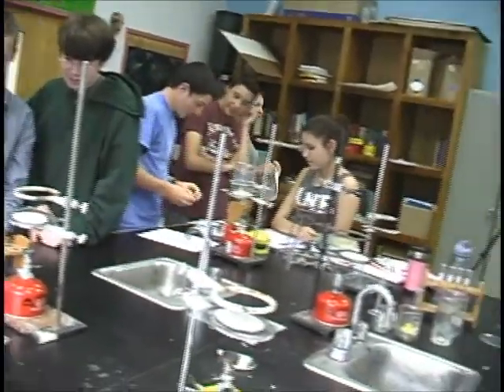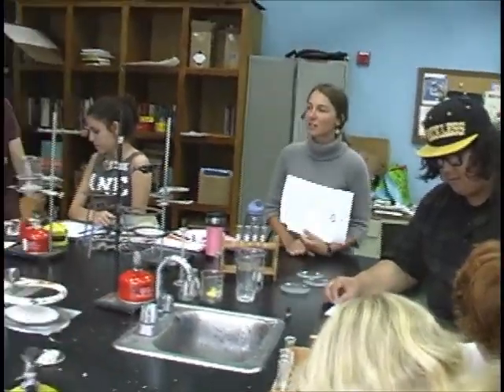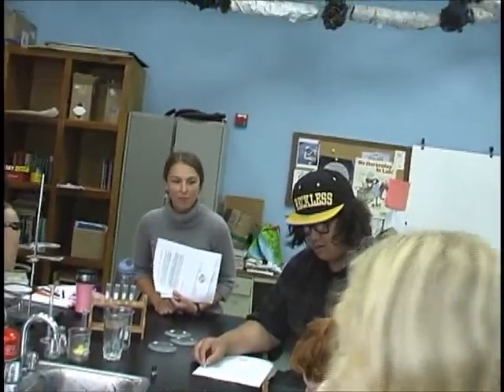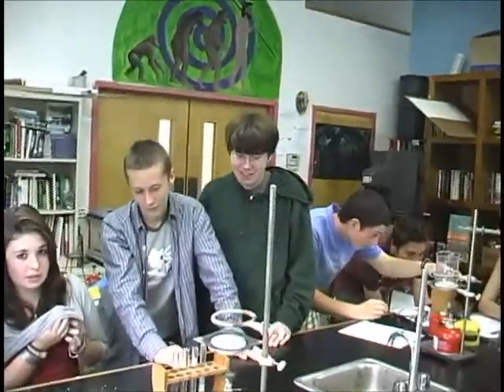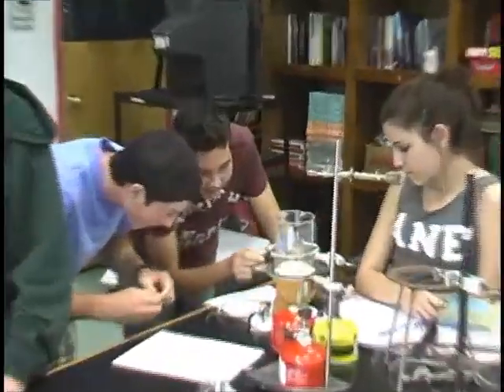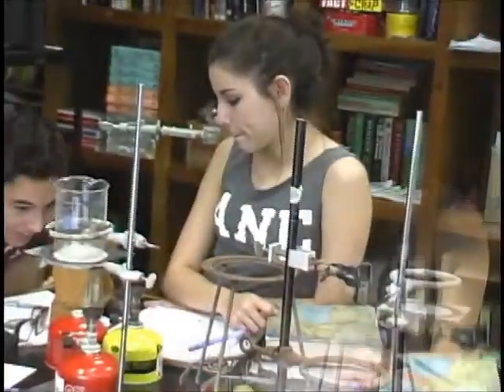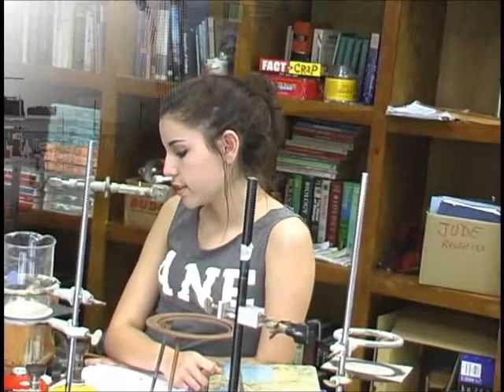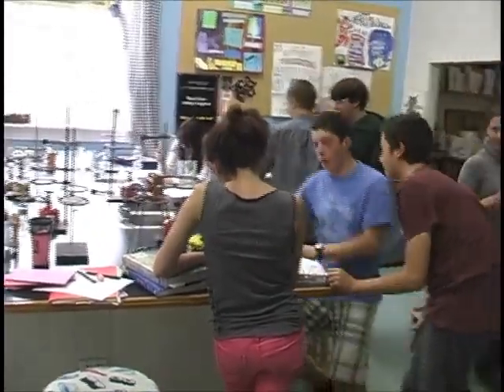Just to let you know, you have about 3 more minutes to come up with your hypothesis, because it looks like you guys have been able to look at what the difference is in each of them. What do we have? I mean, they're all acid. I think that maybe A is the most acidic. That's what I said. B is acidic, but not as acidic as A. C is a little bit acidic. Second to least.